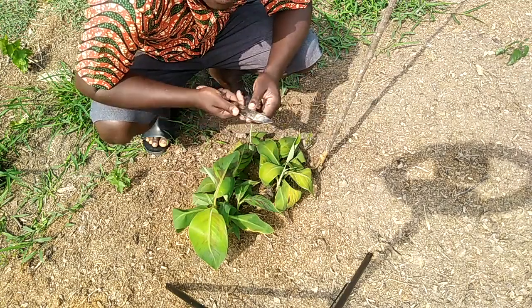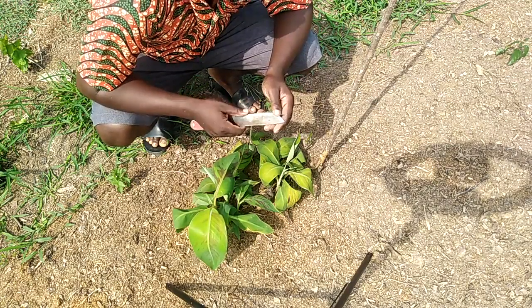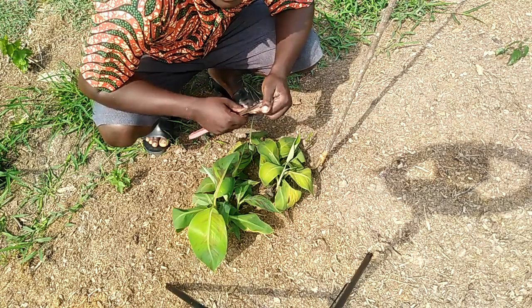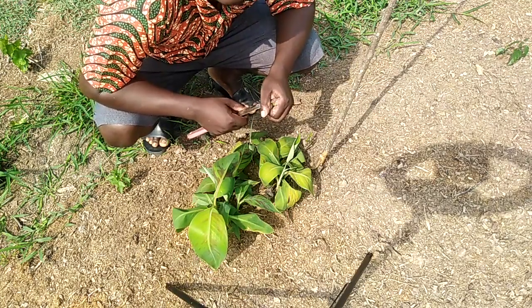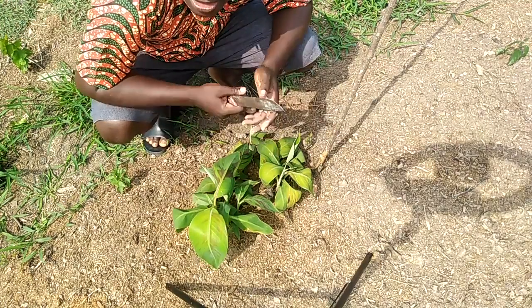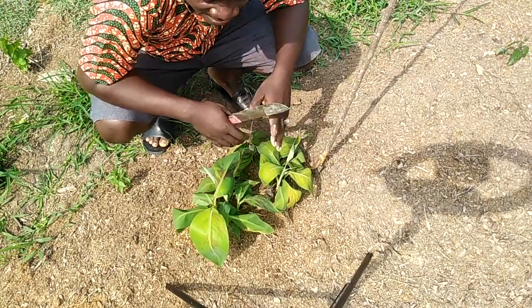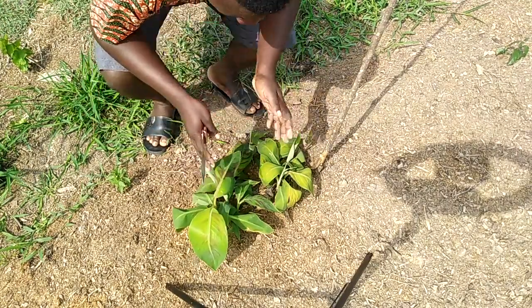If you look at this practical work that we did about 30 days ago, we used coconut water and soaked our corms in it. At the end of the 30 days, this was the result that we had.